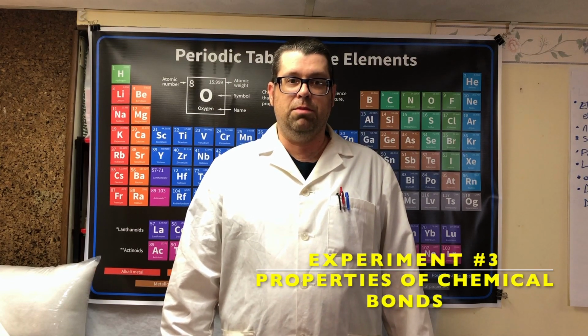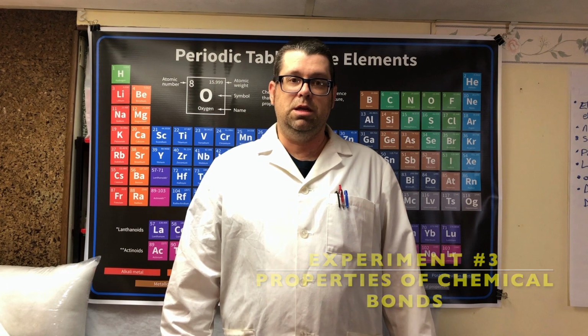Hello everybody. In today's experiment we're going to be looking at properties of chemical bonds. In chemistry there are three basic types of chemical bonds. There's metallic, covalent, and ionic. And all of their properties are based on how the electrons interact between the atoms in those bonds. Usually the properties are a result of the way that the electrons are used in the bonding process.